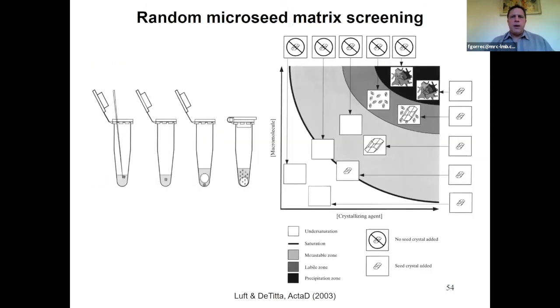A modern approach to this, which may be easier, is to take any kind of crystals that you produce initially and put them in an Eppendorf with a bead. When you vortex it, this mashes up all the crystals, so they will have a lot of different sizes, shapes and types of crystals, and you will rescreen, like proceed with an initial screen again.